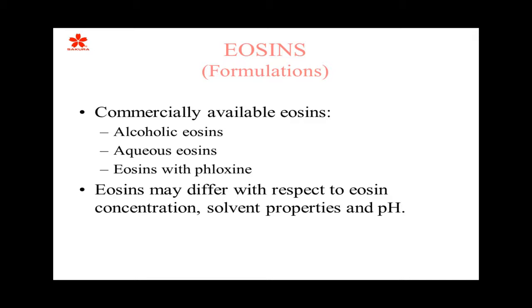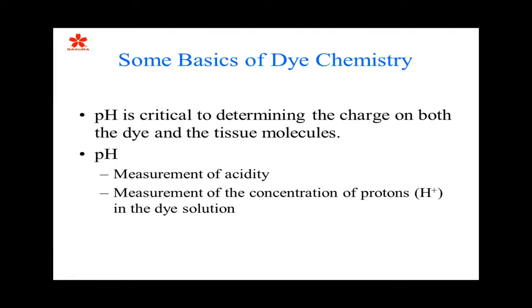And the slide that I showed you in the beginning that showed the really red blood cell staining, and I said it looked like phloxine, that was stained with a method where I did not go into alcohol first. I used a very strong alcoholic eosin and went right into that and still got the same staining intensity as I would with phloxine. So just a matter of thought, some of these eosins on the market can allow you to eliminate that alcohol that you go into before you go into your eosin dye.